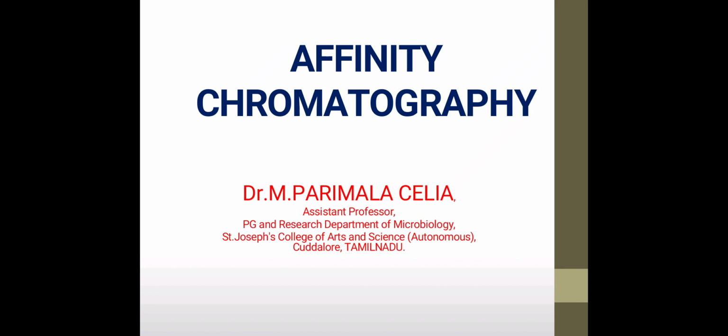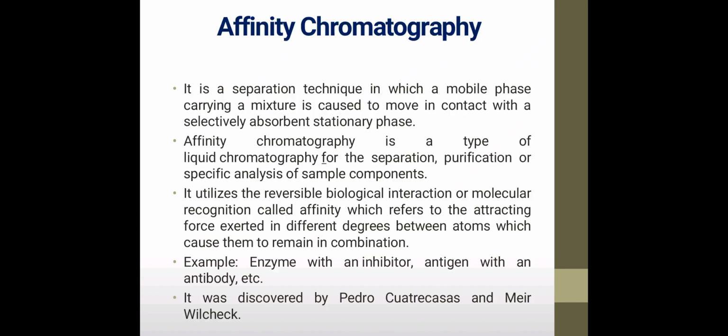I am going to talk about affinity chromatography. Now let's see what is affinity chromatography.